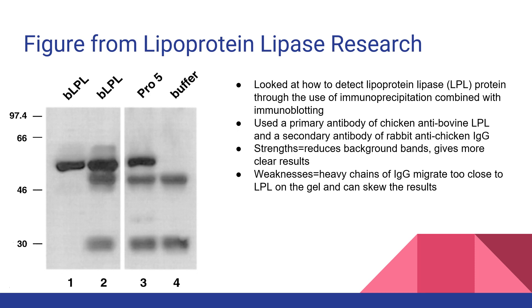However, one of the major weaknesses that this experiment had was that many of the heavy chains of IgG ended up migrating too closely to the LPL on the gel, which may have possibly skewed the results due to either cross-contamination or there being too much of the antibody appearing on the gel than was supposed to.